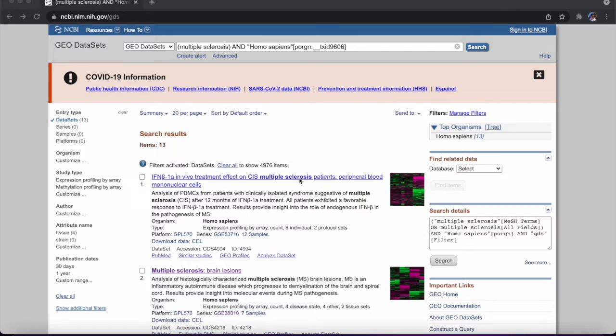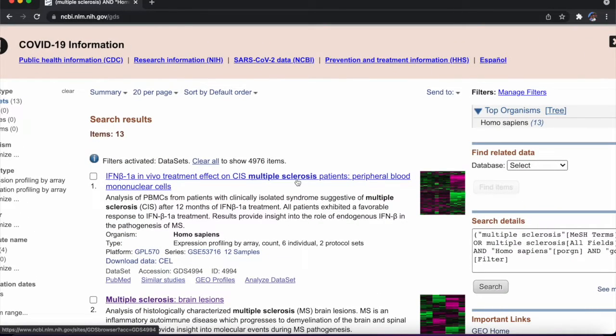All right, so we are back in our Gene Expression Omnibus, and we are finally on our way to deciding our very own dataset that we can use for our project. So let's just go one by one. There's only 13, so we don't really need to, just look at it from a broad point of view. But normally when you're doing a much bigger project or a much more common project, there will be a bunch more search results, right? If you're doing Parkinson's or something, you might have maybe 130. So going one by one is not the way to go. But for now, let's just go through it so you get a better understanding of how we want to find our dataset.